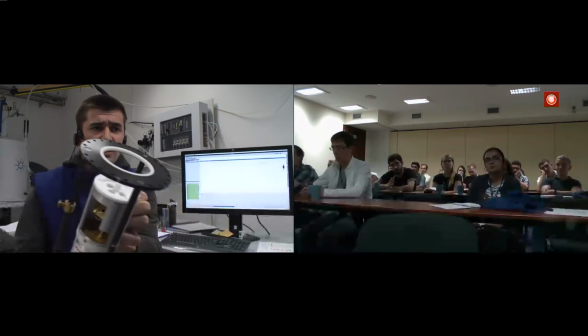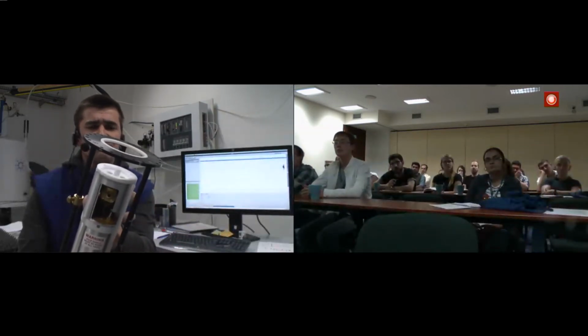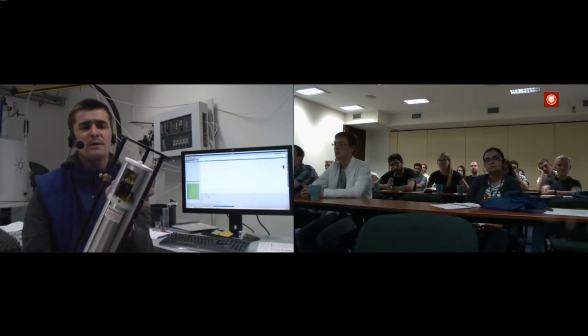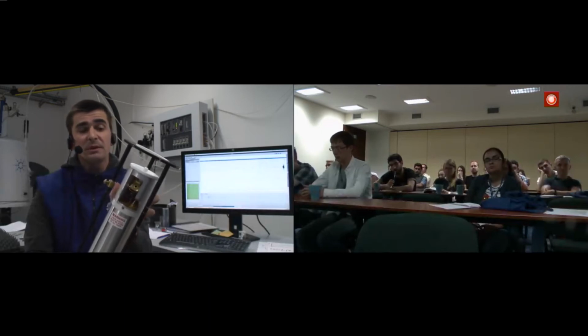Within that stator, you can place your rotor, and you can develop a so-called air cushion. So you make your rotor levitate, which reduces the friction between the rotor and the stator.